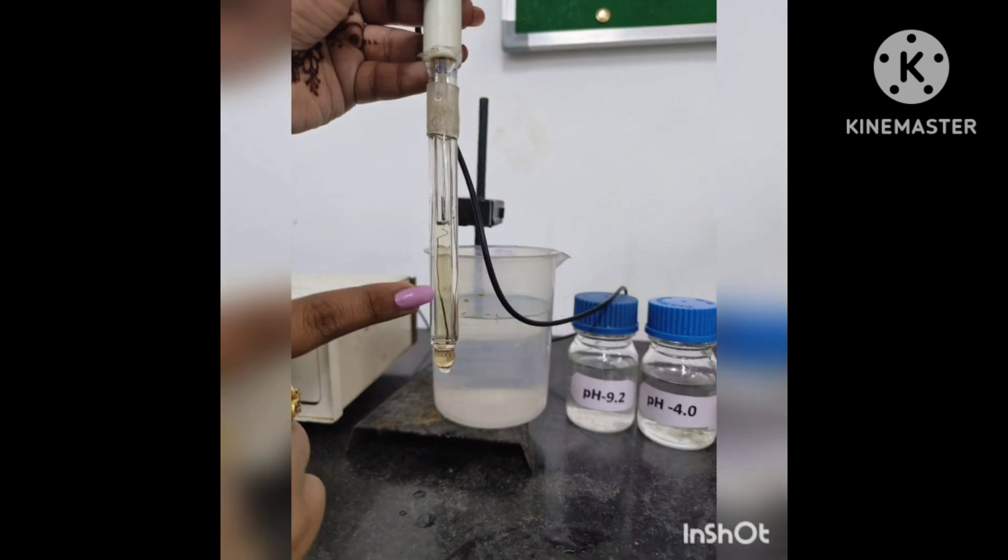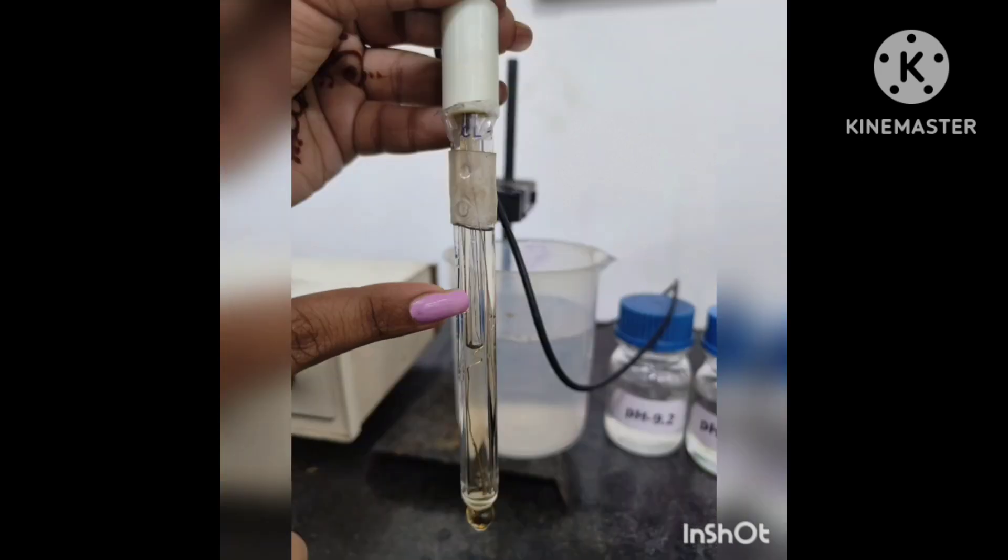The potential created at this junction between the KCl solution and the test solution is nearly zero and unaffected by anything in the solution, including hydrogen ion.